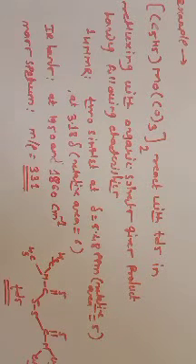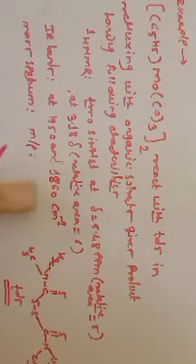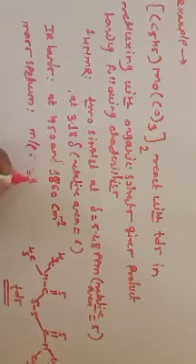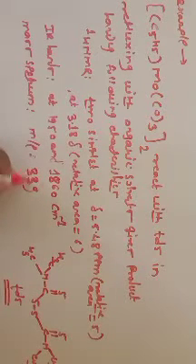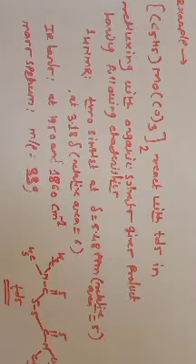Its mass spectrum is also recorded, and we get the molecular ion peak after elimination of a single electron from this product. Its mass to charge ratio is 339.